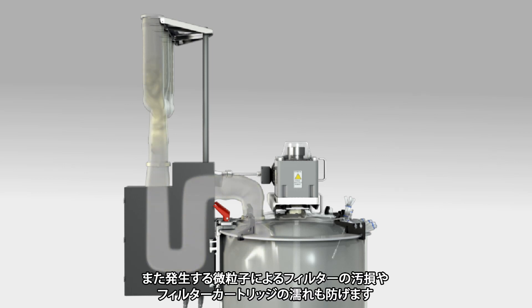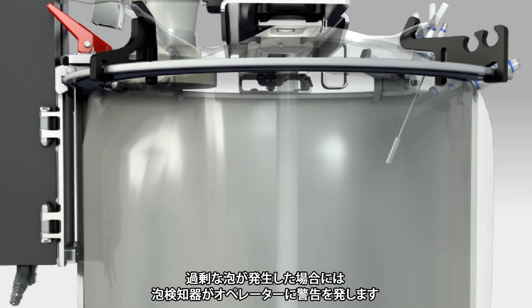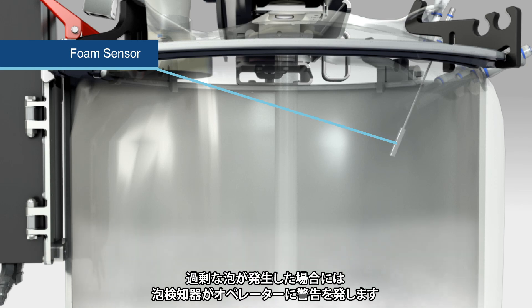The exhaust system is available with an optional condenser plate to minimize evaporative losses. It also prevents filter fouling caused by generated particulates and wetting of the filter cartridge. The foam sensor will alert the operator in case of excessive foaming.